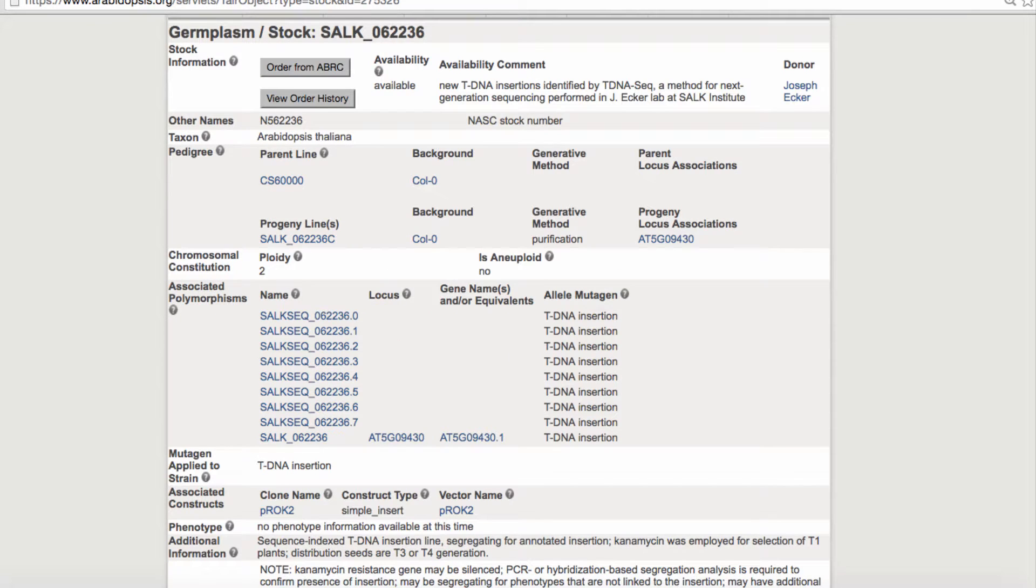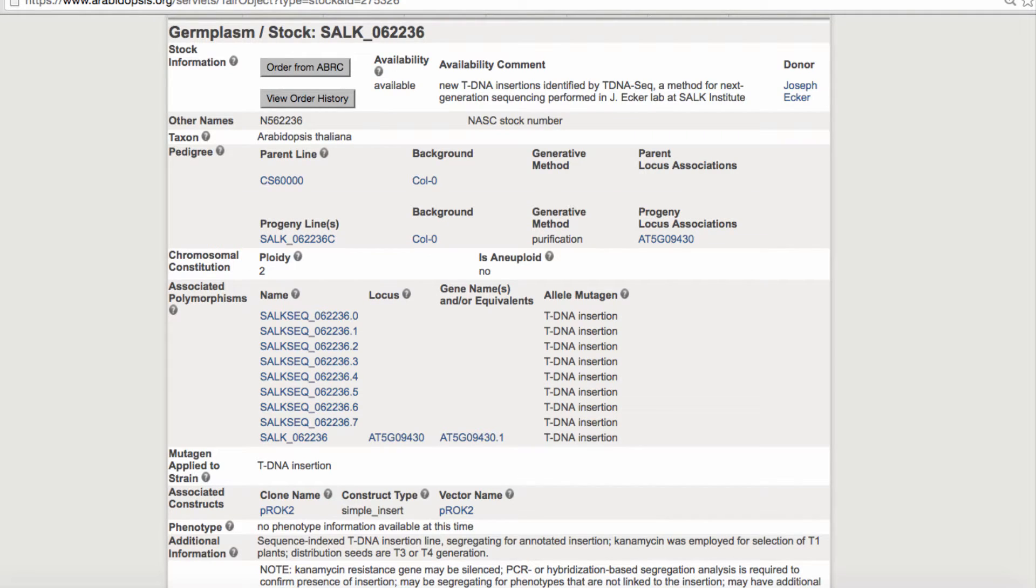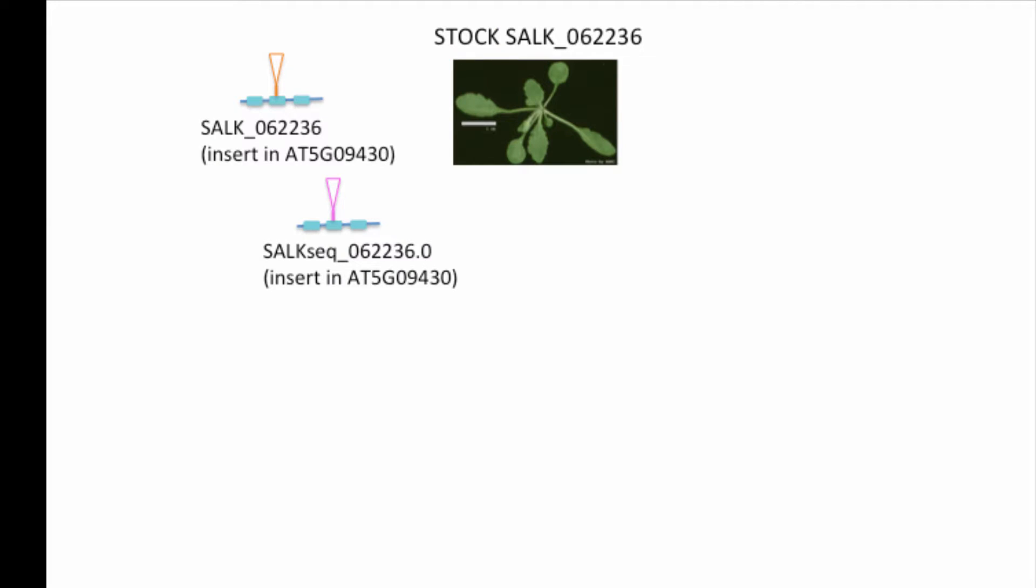You may also notice that there is a purification progeny line shown on the germplasm page. So which line should you order? It all depends on which insertion you're trying to look at. Now if you recall, the parental line had multiple insertions into multiple locations.